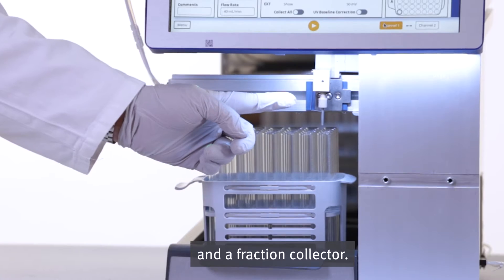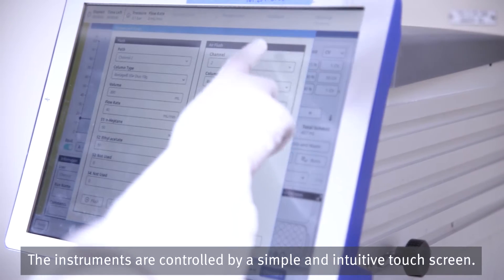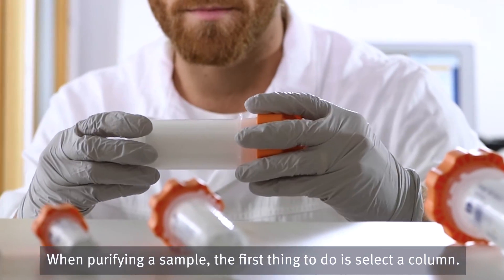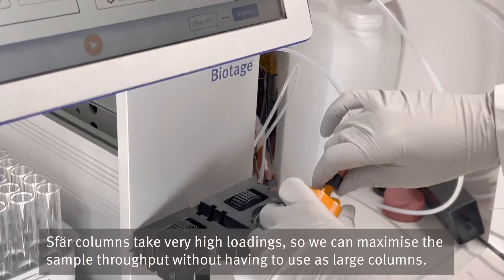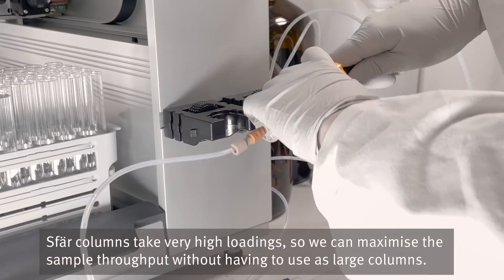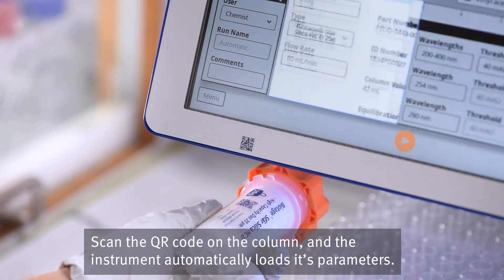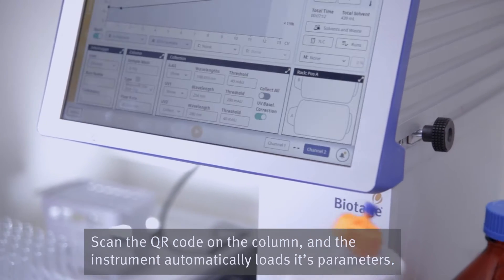The instruments are controlled by a simple and intuitive touch screen. When purifying a sample, the first thing to do is select a column. SFÄR columns take very high loadings, so we can maximize sample throughput without having to use large columns. Scan the QR code on the column and the instrument automatically loads its parameters.